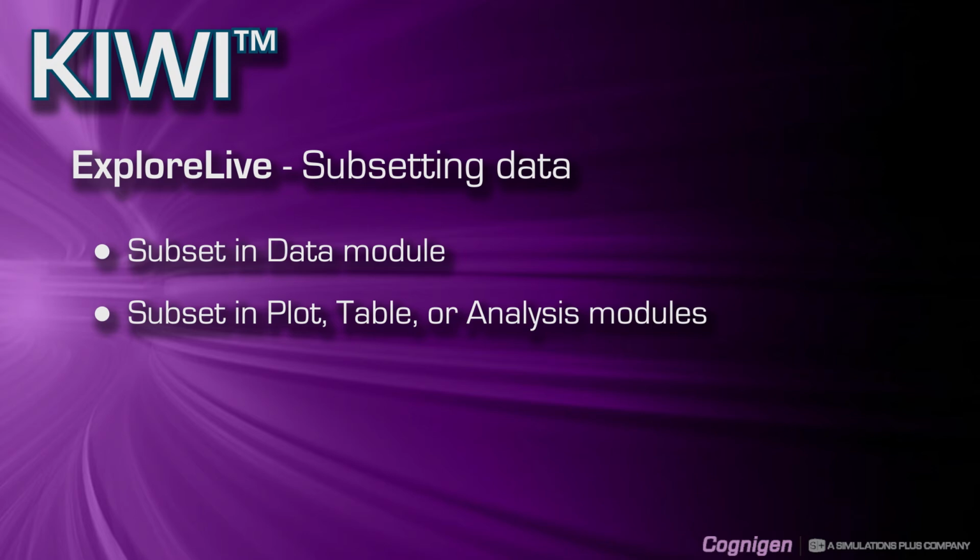Hello and welcome. In this video, I will demonstrate how you can subset data that have been imported in the KIWI ExploreLive module. There are two different ways you can subset data in ExploreLive.